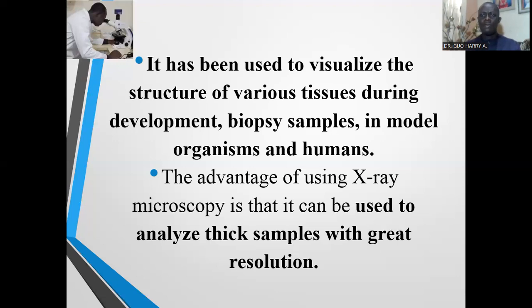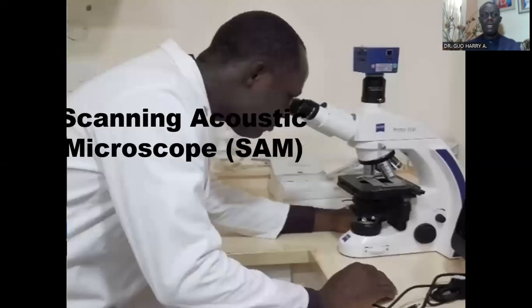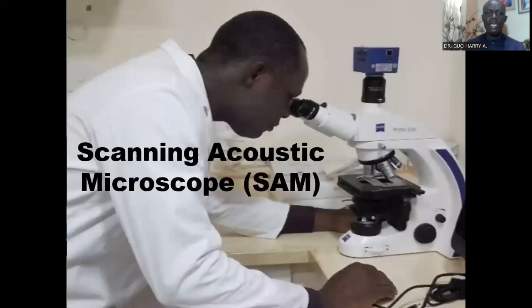The X-ray microscope can work on thick samples with great resolution. These are very important features.